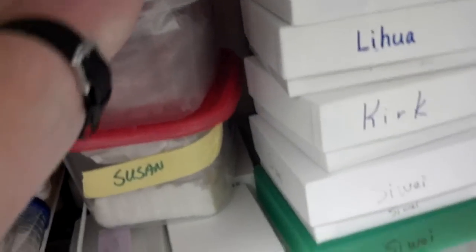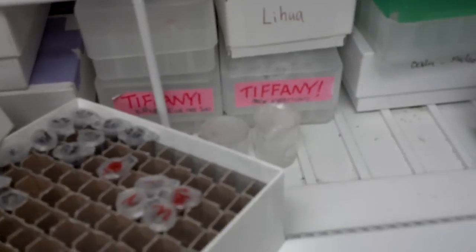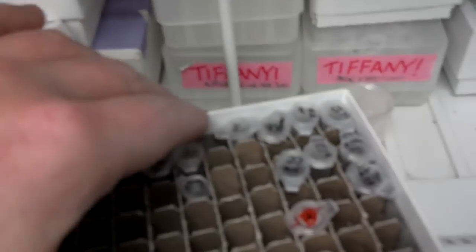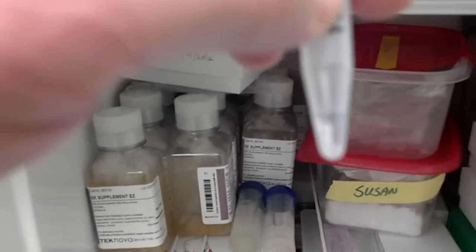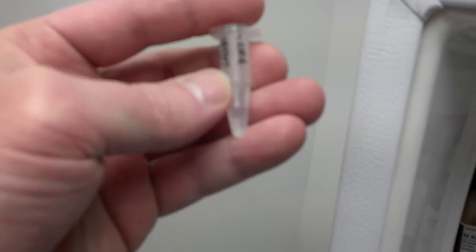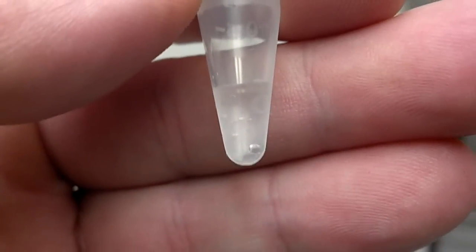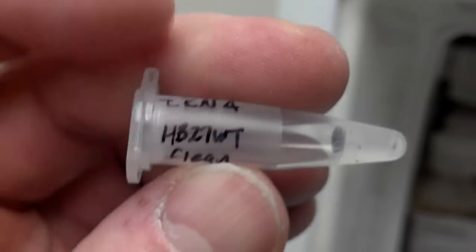This is my box. As you can see there's quite a number of boxes. And in this little tube right here, that little bit of liquid contains column cleaned transfer ribonucleic acid, which we will analyze on those big machines that I just showed you. tRNA HB27 wild type clean. Yeah, so that's that.